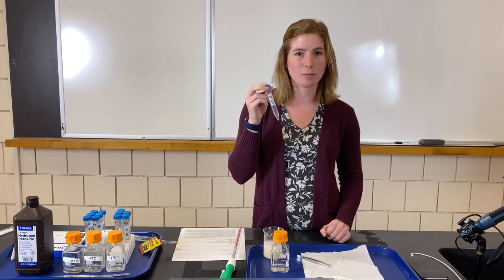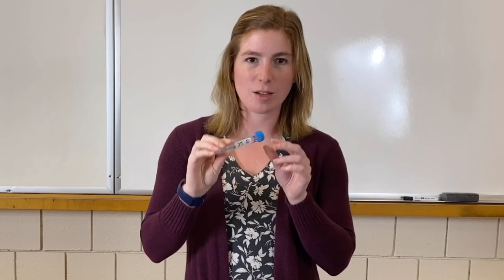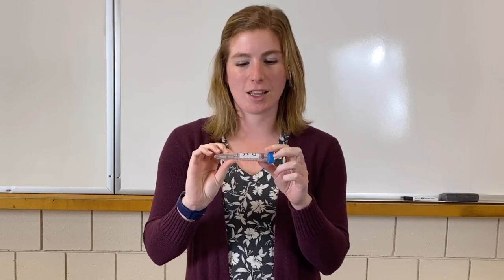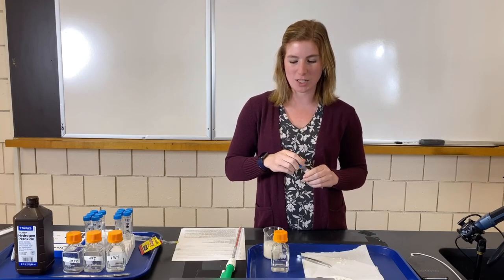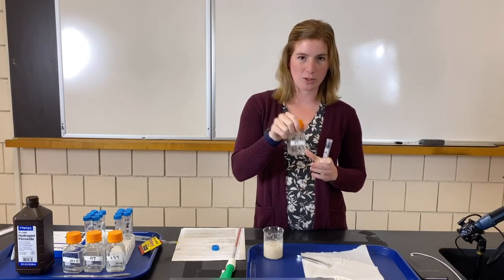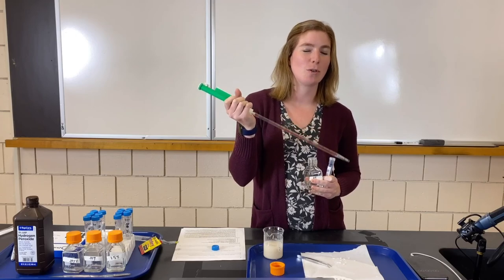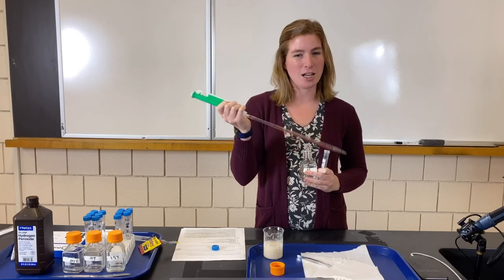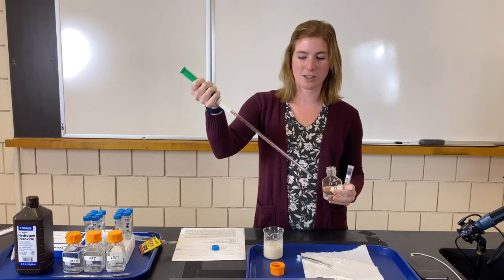I've also already pre-filled many of our test tubes. These are 15-milliliter test tubes and I measured 10 milliliters of the appropriate solution into each one. You should always label your test tubes when doing a lab — I labeled this one as '3%' and 'number one' for the first trial. I have one test tube left empty to demonstrate. I'm going to grab the matching solution and a pipette. Micro pipettes are much smaller; these are larger pipettes for larger volumes, and since we want 10 milliliters, the larger one is more efficient.